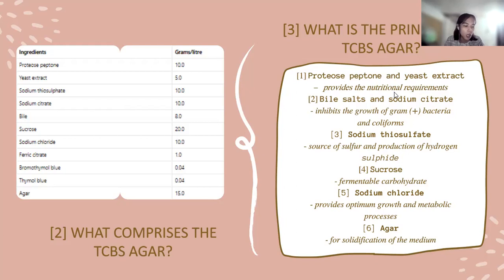So it provides some nitrogen compounds, vitamin B complex, and many others that promote the growth of our microorganisms, specifically the Vibrio species.